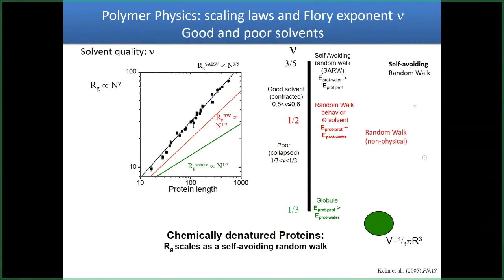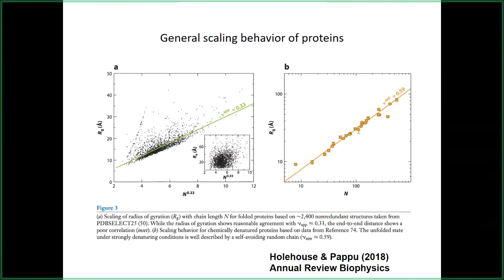Question: How do some of the proteins end up below the line for a solid sphere? I guess I would say the other proteins are not spherical. So proteins aren't ideal spheres, right? They're probably some sort of extent. So most of them, I'd say, are sort of globular, but not perfectly spherical. So my guess is those ones which are below the line are the ones which tend to be more spherical than the average one. But your line's not an average. It's for an ideal sphere, correct?